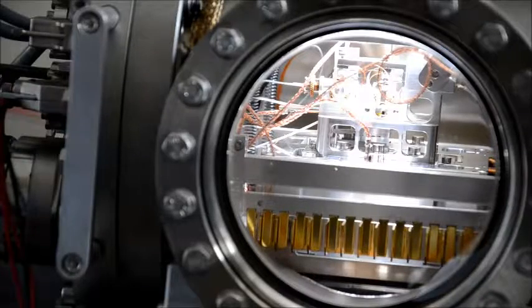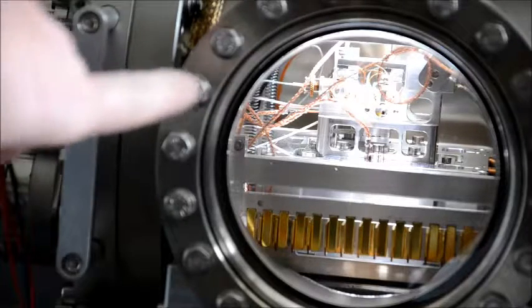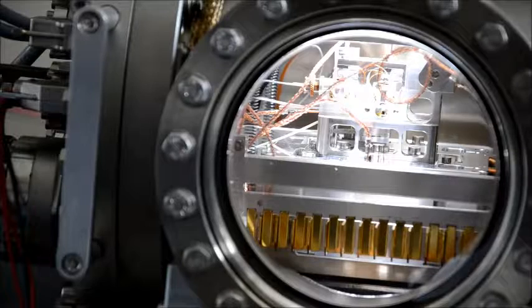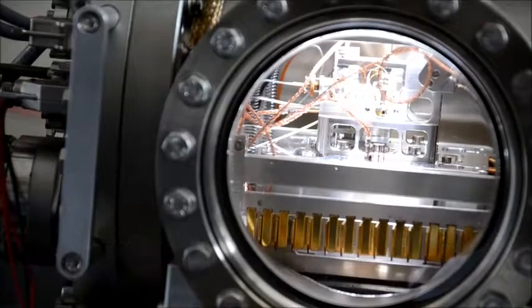Okay, so we see inside the vacuum system, and basically we can see here this large area scanner. So it's a closed loop scanner which moves in X and Y direction and also in Z direction, of course, and from the top we get the AFM tip, which can be aligned relative to these areas of this power semiconductor devices. So the vibrations are much slower, and so we can do the experiments at a much lower vibration level.